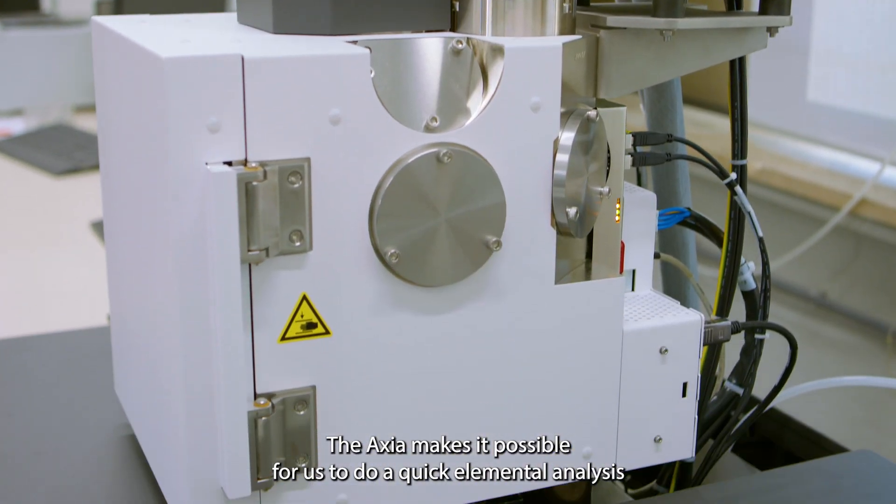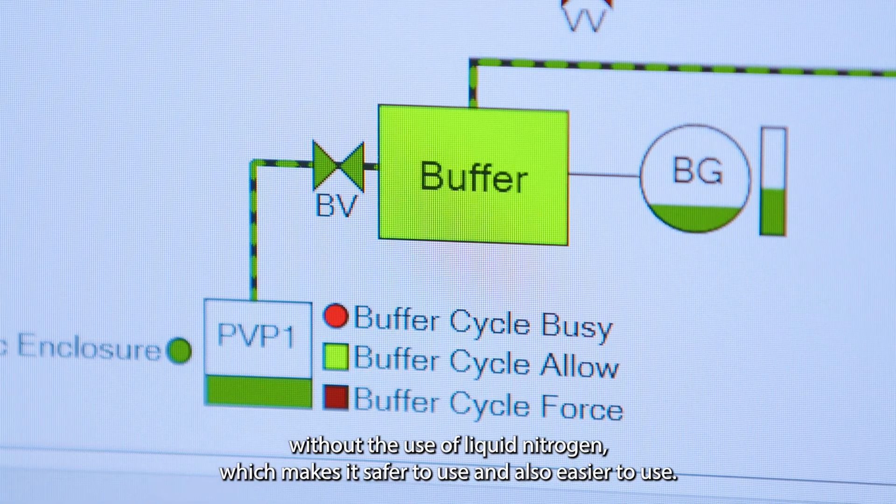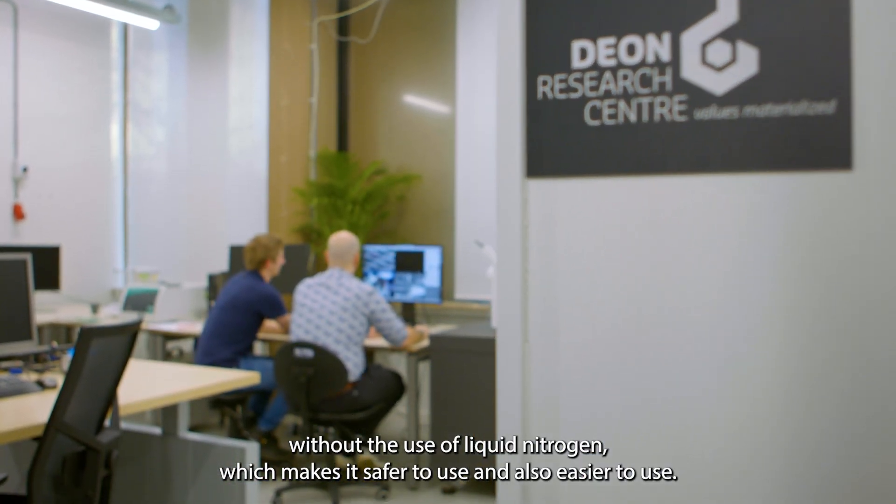The Axia makes it possible for us to do quick elemental analysis without the use of liquid nitrogen, which makes it safer to use and also easier to use.